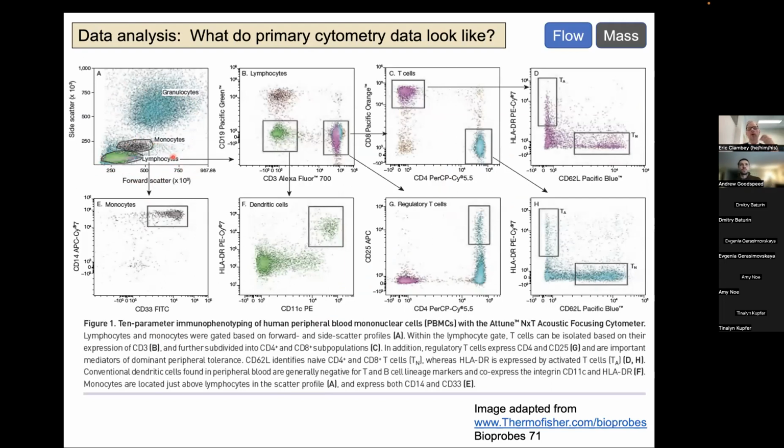And if you want to query the expression of different proteins on lymphocytes, which have smaller cell size or forward scatter, and smaller granularity properties or side scatter, in flow cytometry software, you can draw a polygon around this and tell the software, I only want to look at those cells. And when you do that, this panel is allowing you to only focus your attention on the green cells here, and then querying expression for CD3, a cell surface protein, on the x-axis versus CD19.